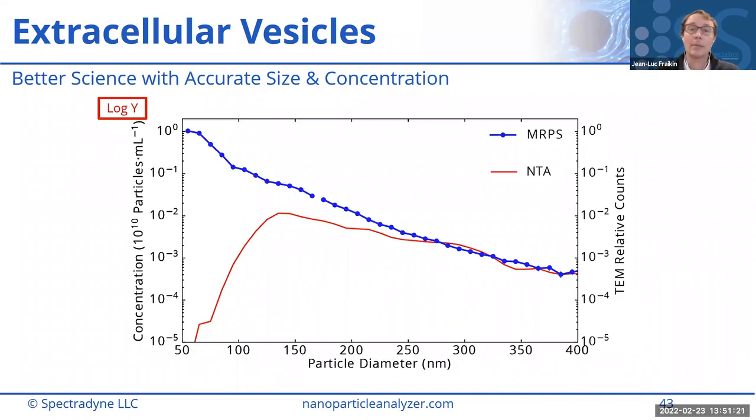A lot of times the sample itself contains enough background proteins or other wetting agents that the sample enters the cartridge on its own. But when an additional surfactant is required, our top choice would be Tween, or another one called Poloxamer, which I think goes by the trade name Pluronic, or BSA is also still an option.